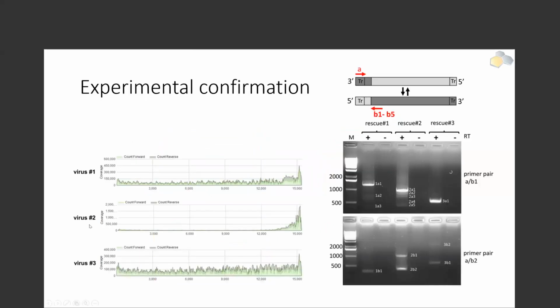So we did that, and the reason we even started looking into this tool is because, as you can see here, the NGS reads were produced for three different viruses, mumps viruses, that is, and then later aligned against the reference. And here we can see the pileups, the positional profile of these alignments.